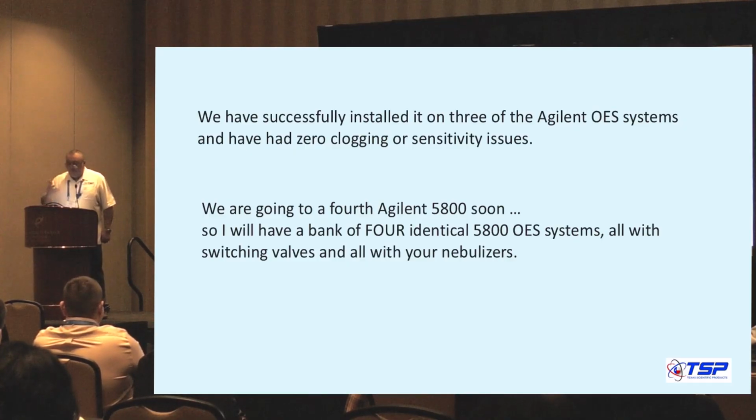Not bad, but with the nebulizer they had, a PFA nebulizer designed for ICP-MS, how it got pushed to ICP emission, I don't know, but that's what was happening. So then they're going to buy a 4th 5800 soon. They will have a bank of 4 identical systems, Agilent, all with switching valves and all with your nebulizers.